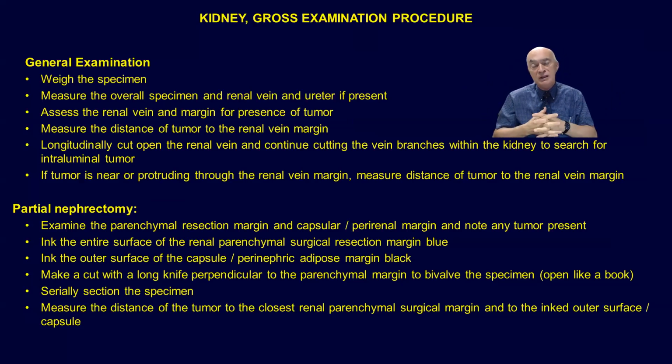And I've seen many cases where we request the resident to go back to the bucket, get hold of the ureter and open it, because the description of the gross examination doesn't say that the ureter was opened and representative sections taken. The fact that the ureter is taken doesn't mean that it has pathology, but in some cases it may, if we don't look for it.